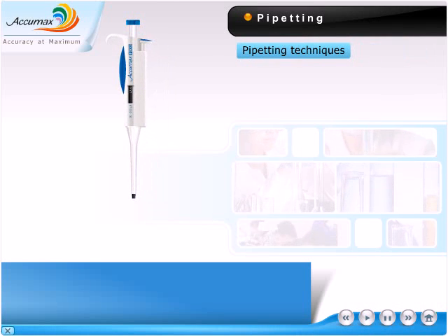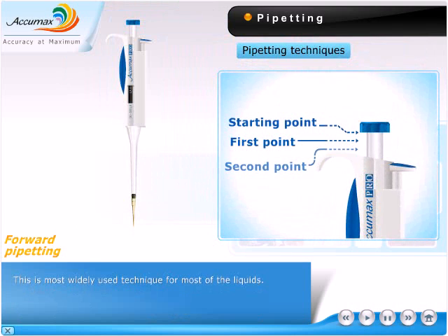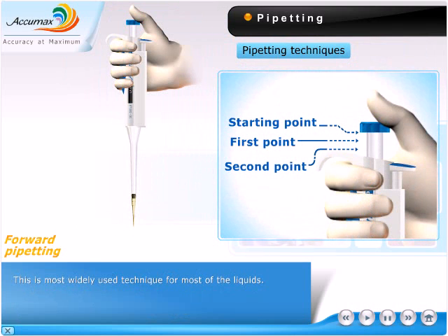Pipetting Techniques. Forward Pipetting: this is the most widely used technique for most liquids.